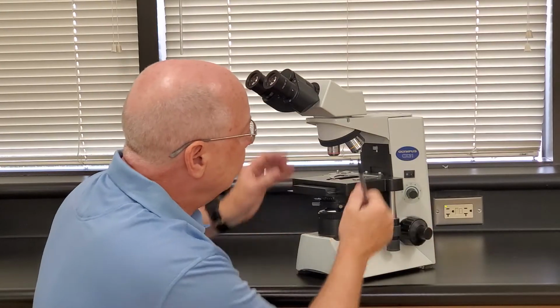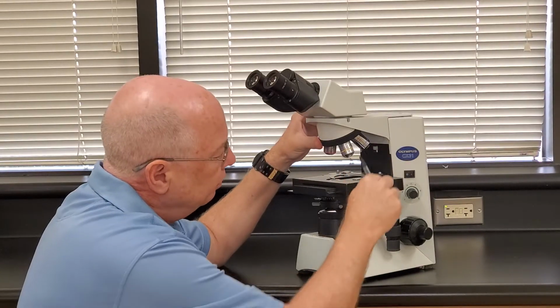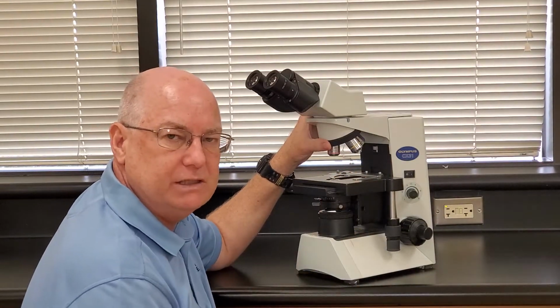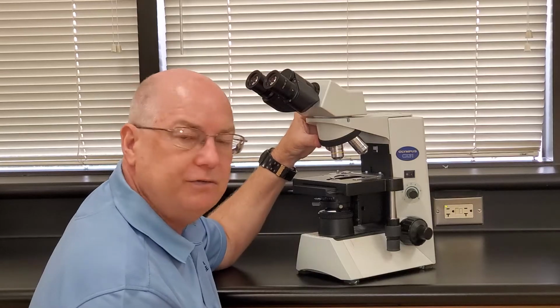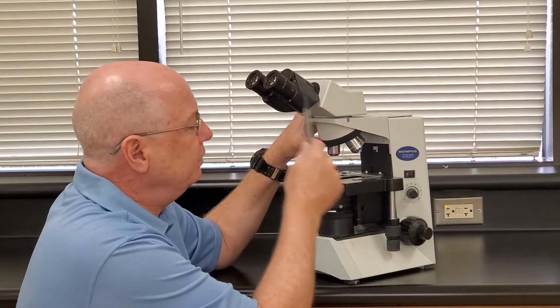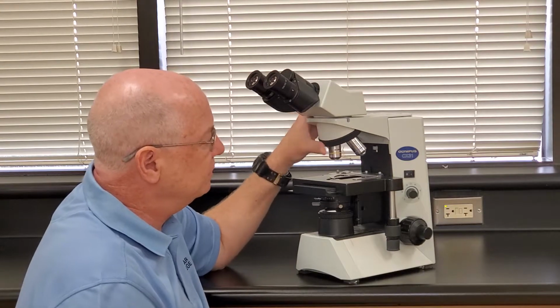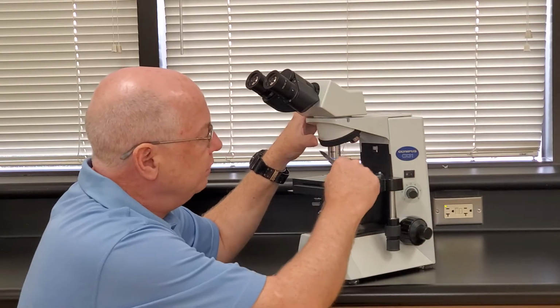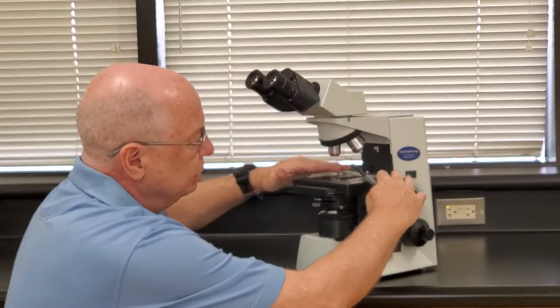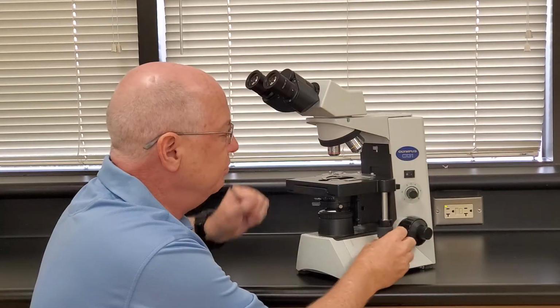Now, down below this part, there's a little rubber wheel here that has all these silver or metal looking structures hanging off of it. This is called a revolving nose piece. Revolving because it revolves or rotates. So some people call it a rotating nose piece, but we have oculars, we have the revolving nose piece, okay? Now the revolving nose piece revolves because it allows us to change which one of these metal objects is pointing down at our stage. So this flat black structure is called a stage or a mechanical stage. It's called mechanical because it moves.